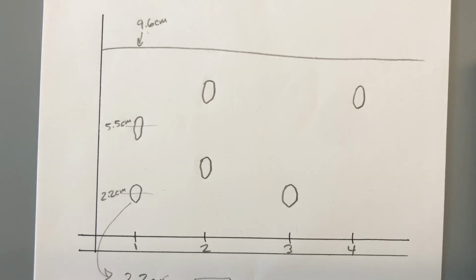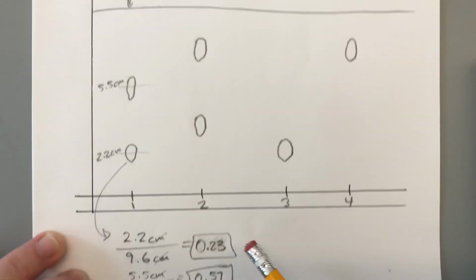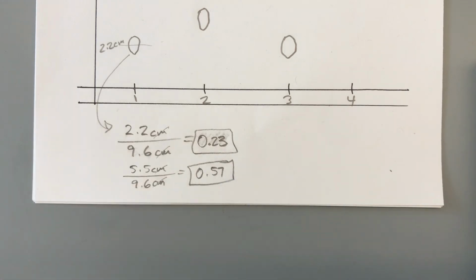And when we get our results of our chromatography in this experiment, I'm going to need you guys to actually measure these retention values. Okay, and I could go through and do all these, but it's literally just this concept over and over and over again.